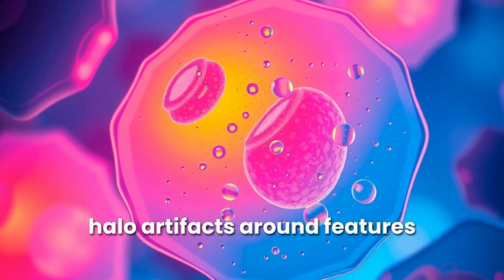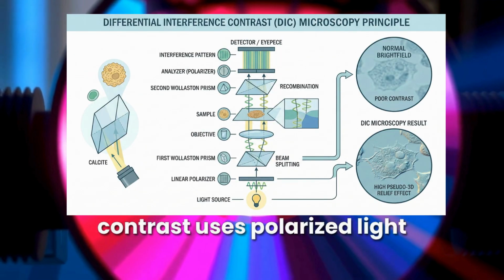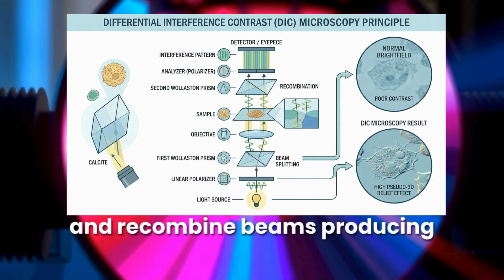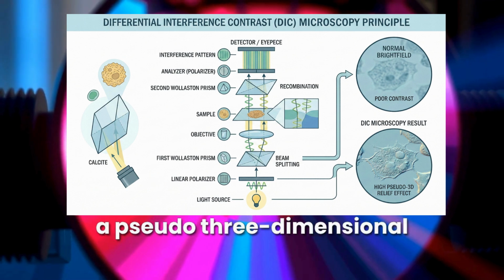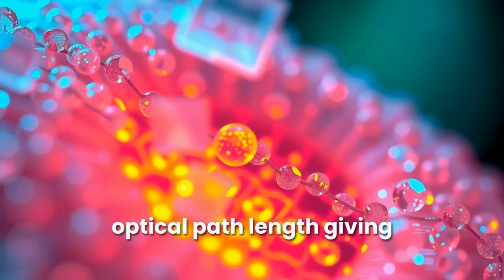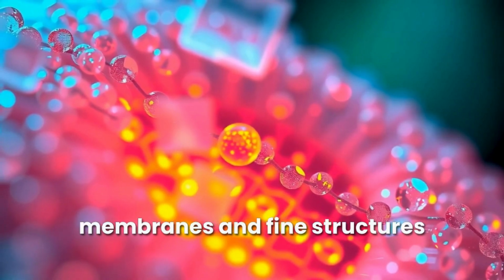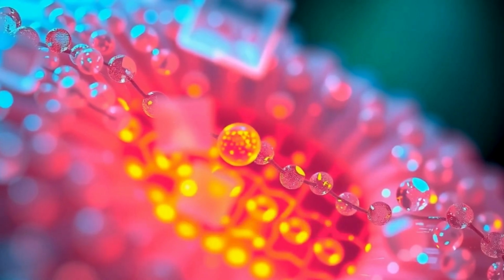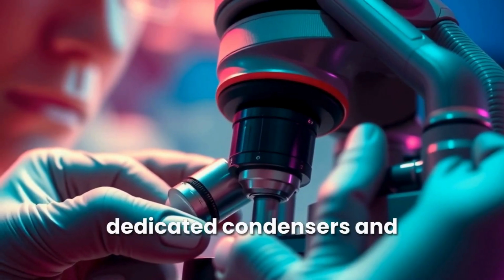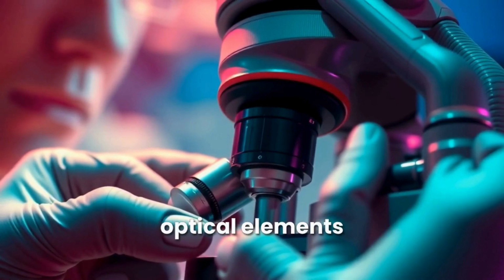Phase contrast excels for live unstained cells, revealing organelles and motility with high contrast, but can produce halo artifacts around features. Differential interference contrast uses polarized light and Wollaston prisms to split and recombine beams, producing a pseudo three-dimensional relief effect. DIC enhances gradients and optical path length, giving crisp, shadowed images of membranes and fine structures without staining. Both phase contrast and DIC require careful alignment and dedicated condensers and objectives designed for their optical elements.